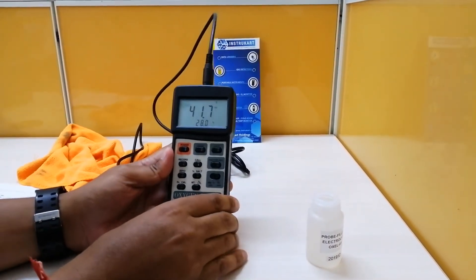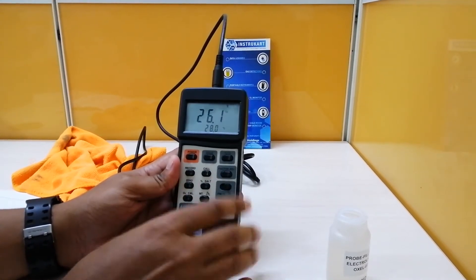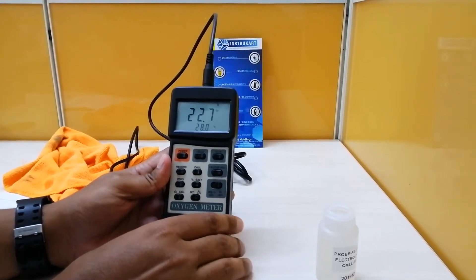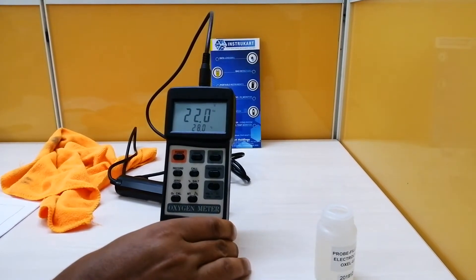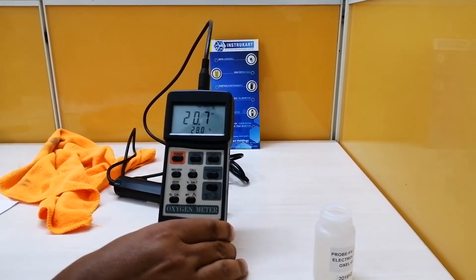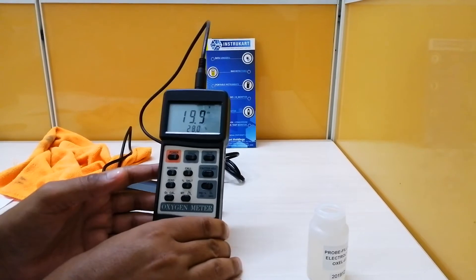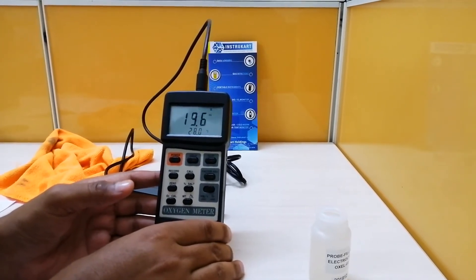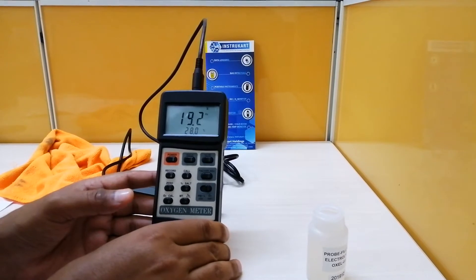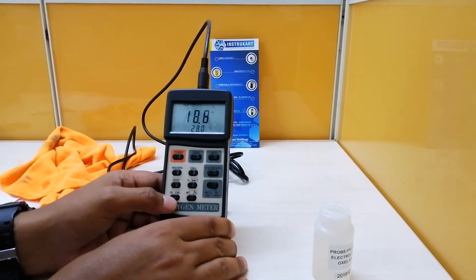There you go — you can see the values will be a little unstable in the beginning as it is currently calibrating the probe. We have to wait until the fluctuation stops. Once the fluctuation stops, we press the O2 cal button.